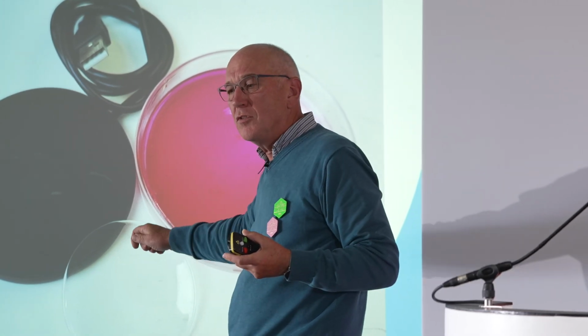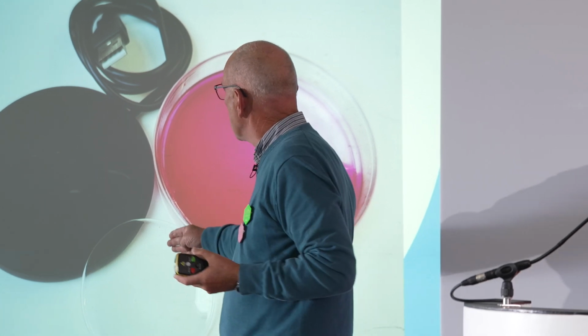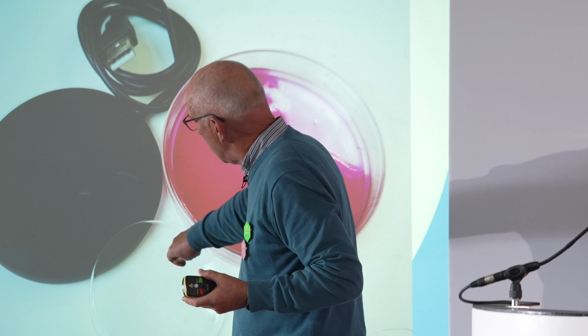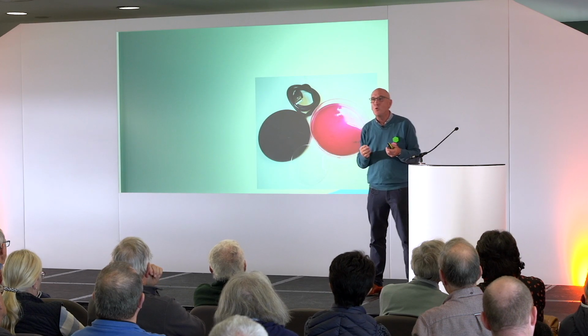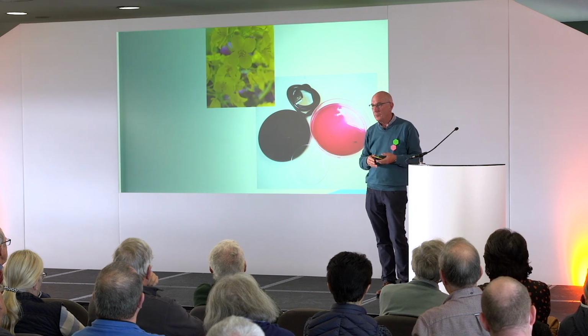I put some IPA in here to get rid of any grease. Put my anthers in there, swirl it round, that gets some pollen, put it onto the slide, put it on here to dry off, put some stain on, cover slip, Bob's your uncle. It's a very simple way of doing it, and it gives you a very good image going forward.